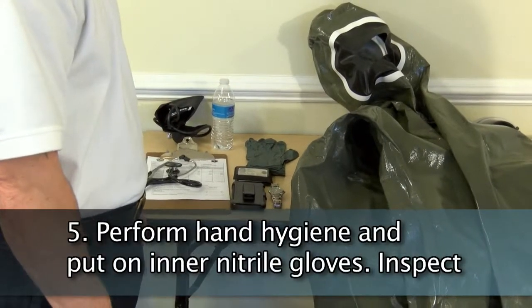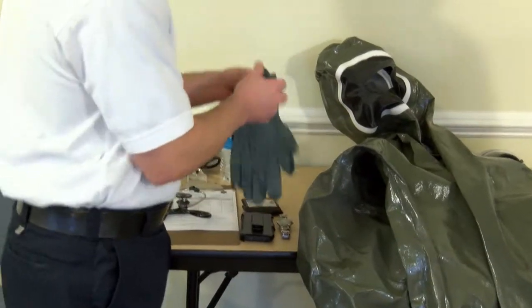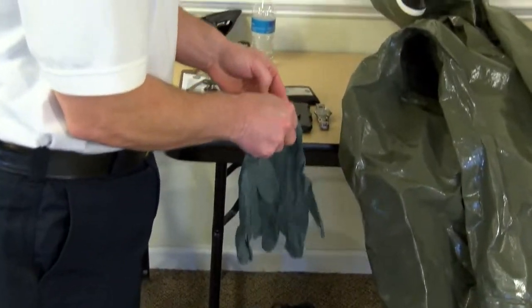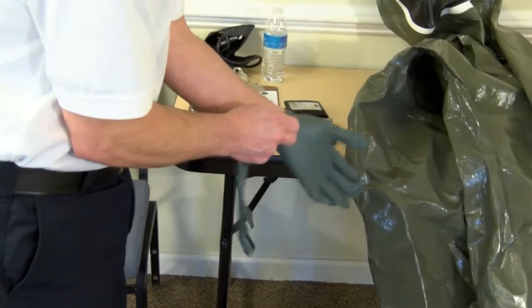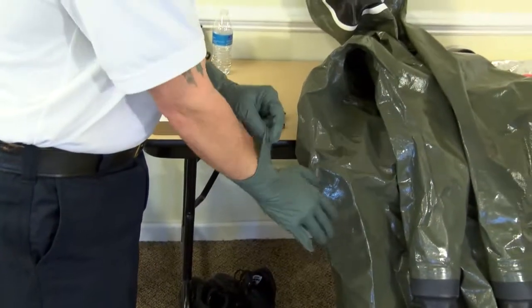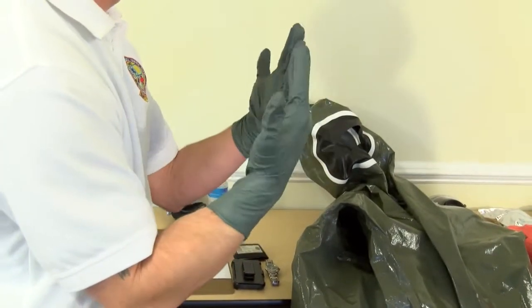Don inner nitrile gloves and inspect. It is sometimes helpful to choose a smaller actual size for the inner glove and a size up for the outer glove to ease donning and doffing. It is desirable to have a snug fit over the wrist and forearm to minimize the risk of exposure.